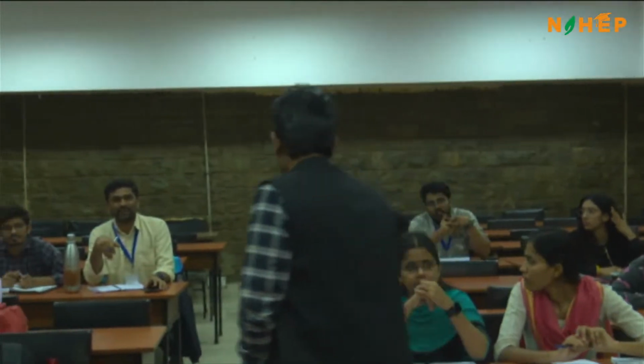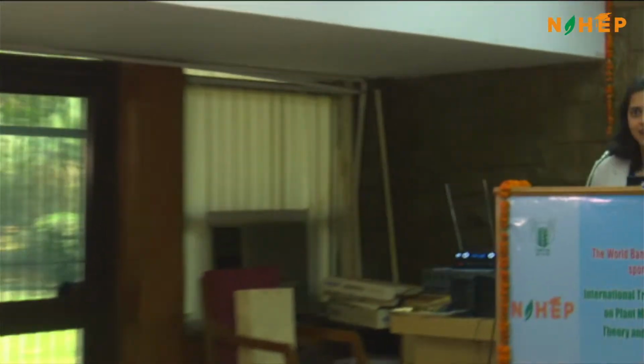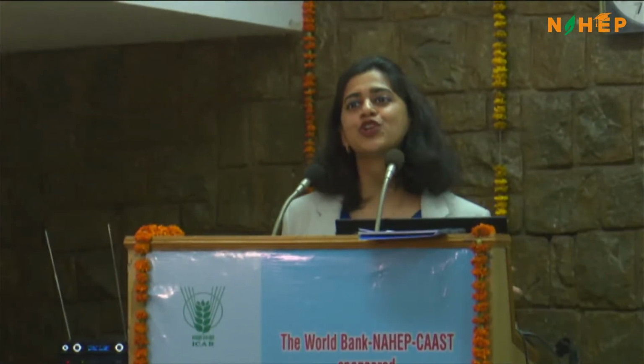Yes, entirely different. You will not have 100% of the reads removed in that case. Still, you will have things which will come. When you are blasting it, you will also get homologous hits, right? At gene level you remove. See, when there is unknown stuff, obviously the complexity is going to be more, right? So we just want to reduce the complexity.